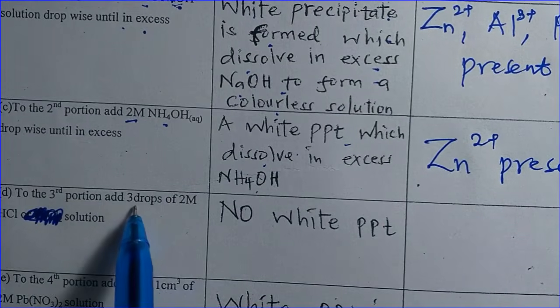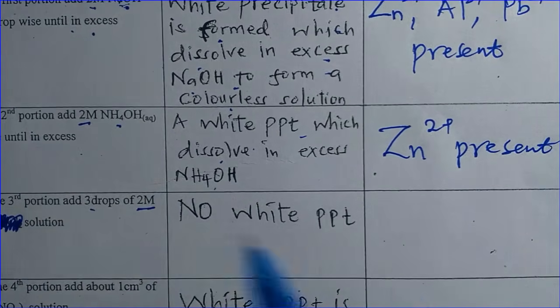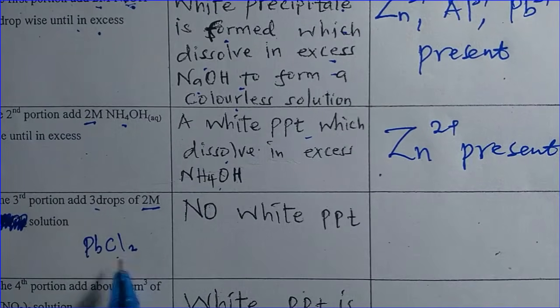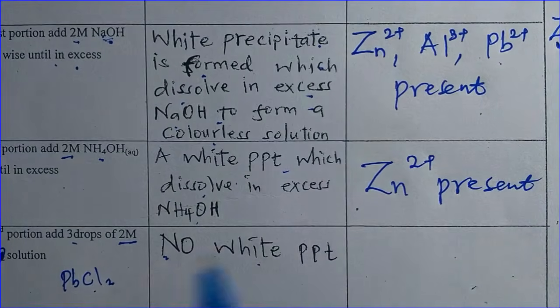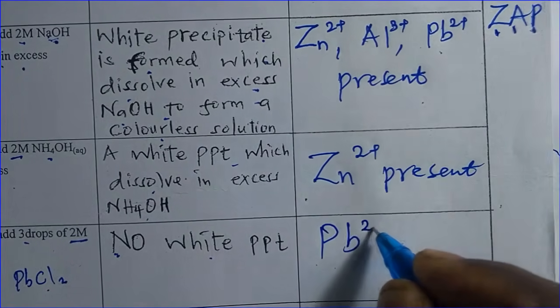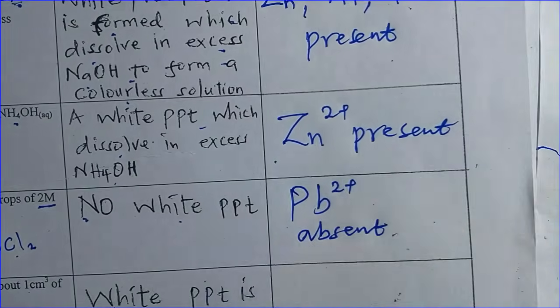To the third portion, add 3 drops of 2 molar HCl. If you add HCl and lead was inside there, it will form a white precipitate, which is lead chloride. Lead chloride is a white precipitate. Now, since there is no white precipitate, it means lead is absent, because the chloride was expected to combine with lead. But now that there is no white precipitate, it means it is absent. So for inference, you just write lead 2 ions absent, because already we have confirmed what is present.